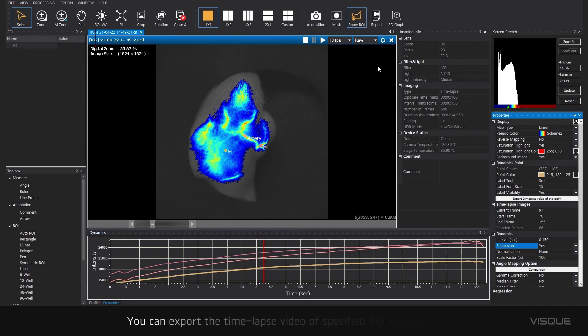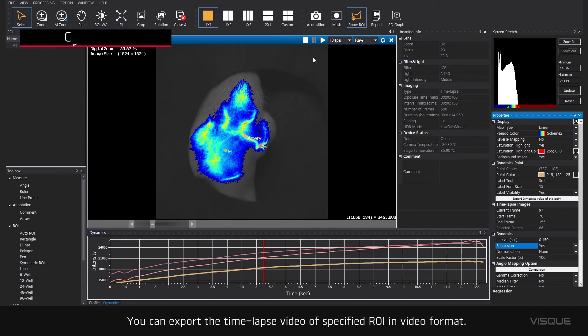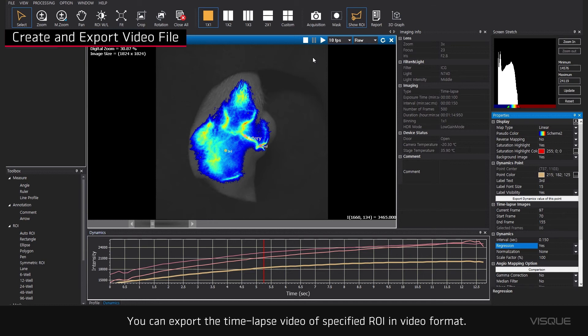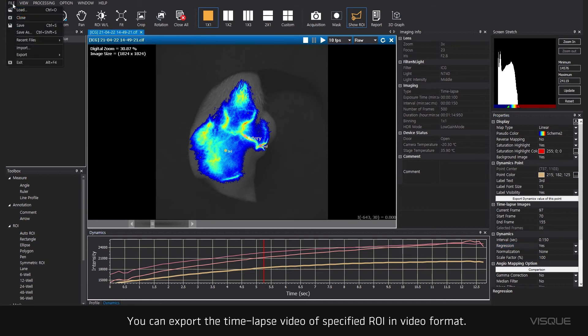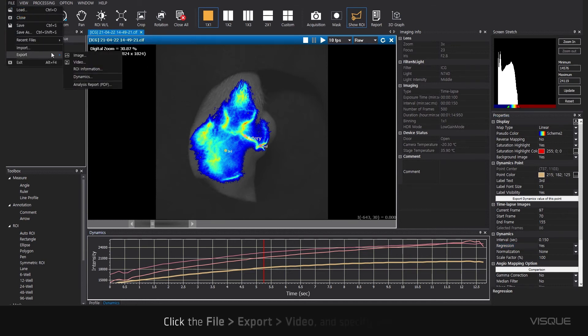You can export the timelapse video or specified ROI in video format. Click File, Export, Video, and specify a file name.